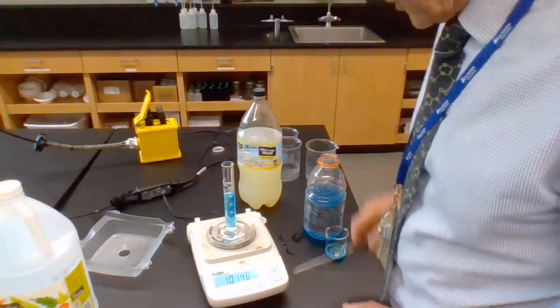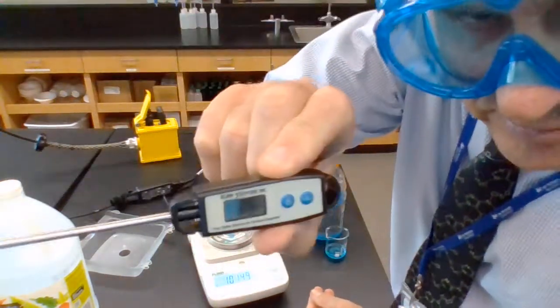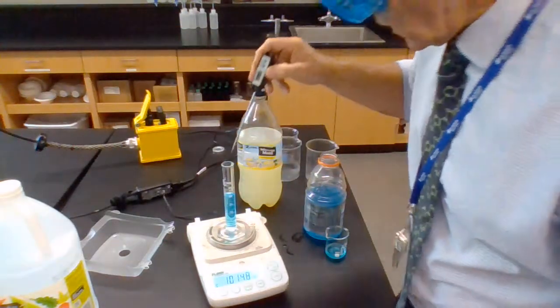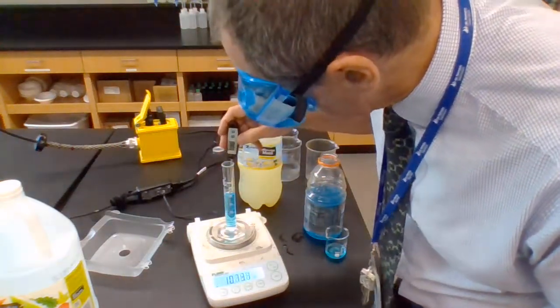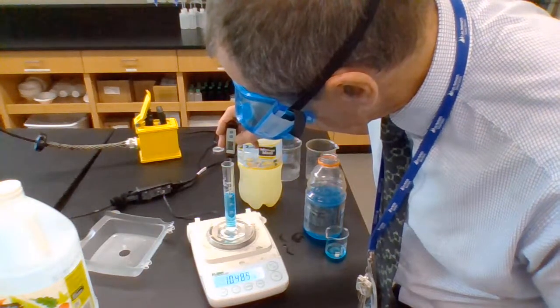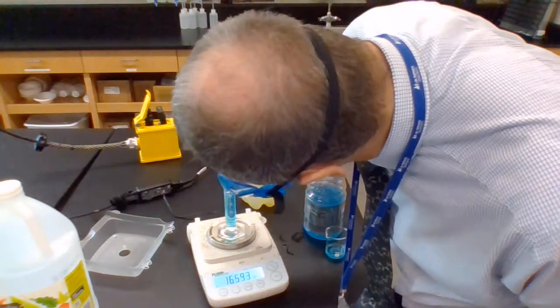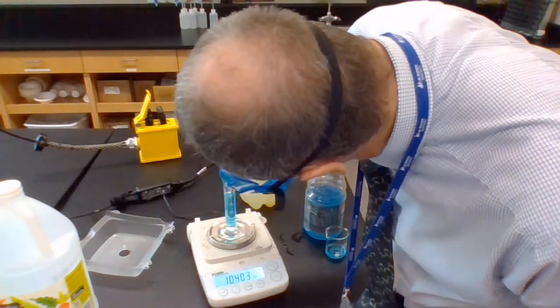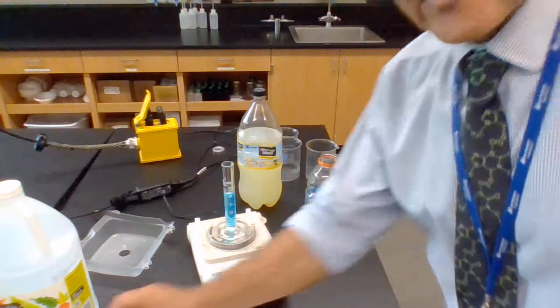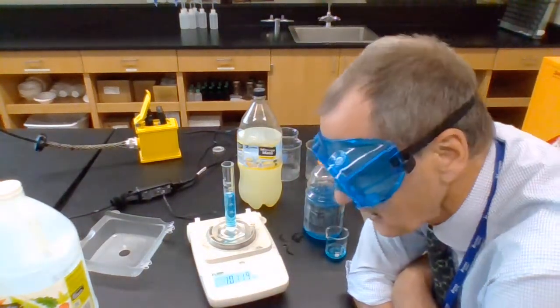You also are supposed to measure the temperature because you all have a handy little digital thermometer here at your home, I'm sure. That is extremely precise. And you'll find a temperature when it stops moving. But my thing here gives me 14.4, which gives me a precision of 0.1 degrees Celsius.